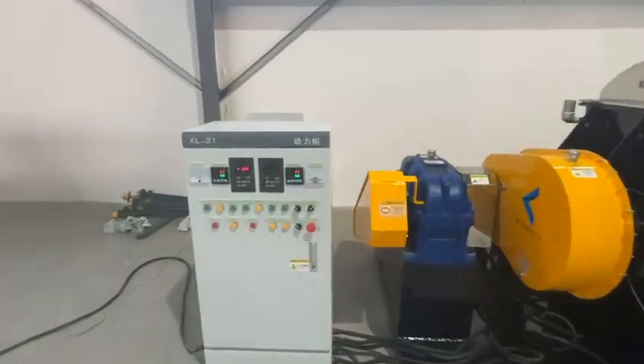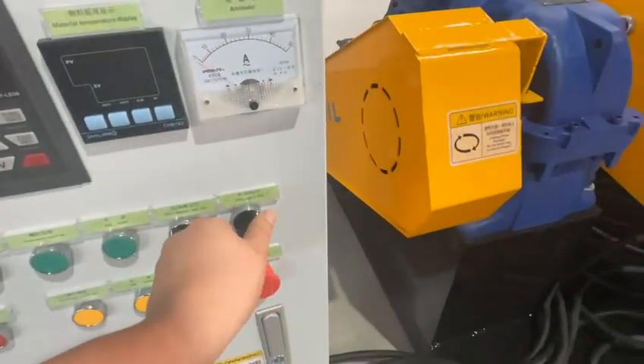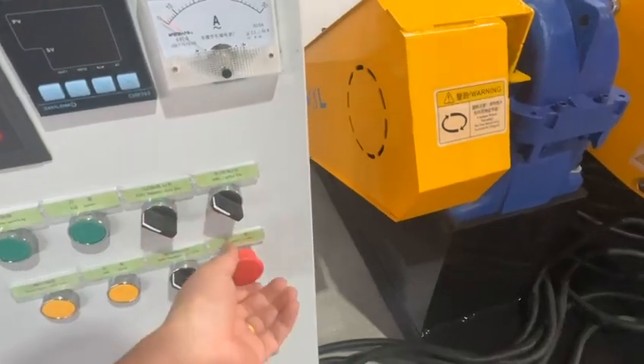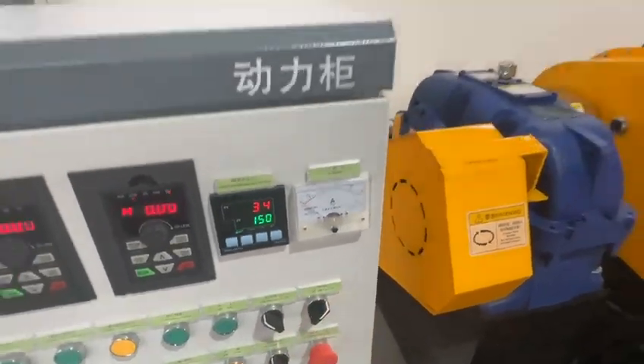The mixer has been connected with electricity power. This is an emergency stop button — light off and light on. First, we release it and make the light on.